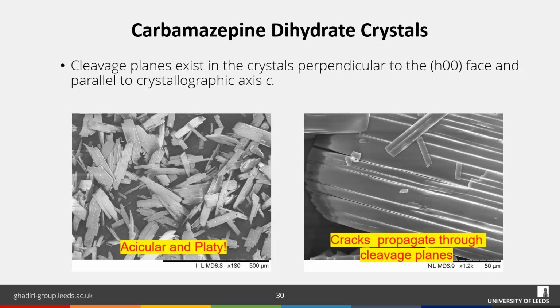What we are seeing here are some of the SEM images of the carbamazepine dihydrate crystals. It is very clear that they are of high aspect ratios and they are very platy. The dominant face is the h00 face, and we can see the cleavage planes that are perpendicular to the dominant crystal face.